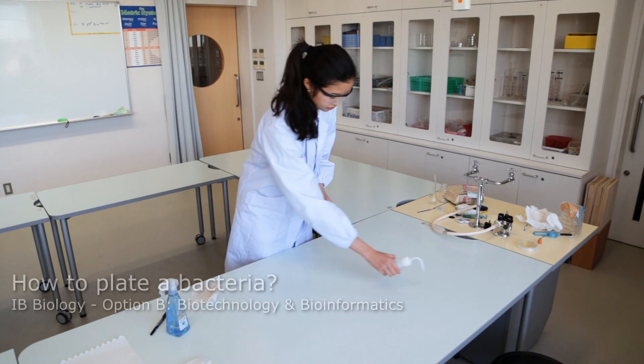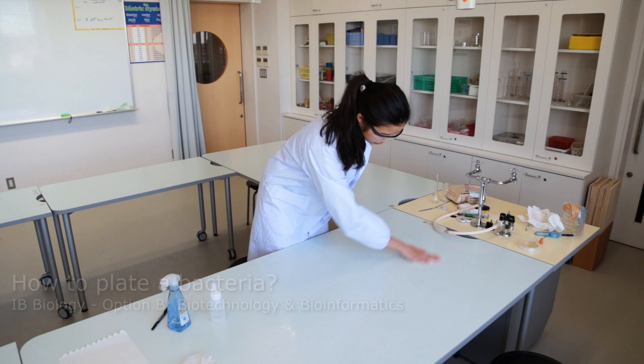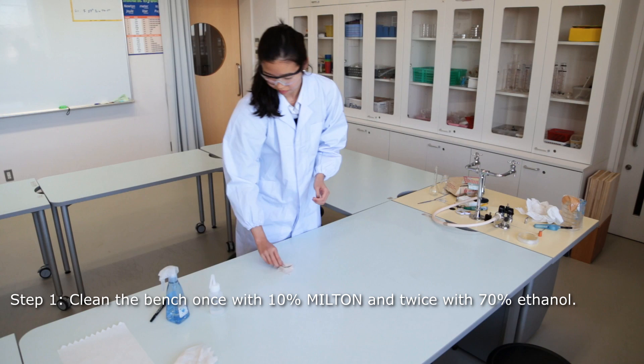Start by cleaning and sterilizing the workspace. Spray once with 10% Milton and wipe thoroughly using clean tissue paper. Repeat twice but with 70% ethanol.